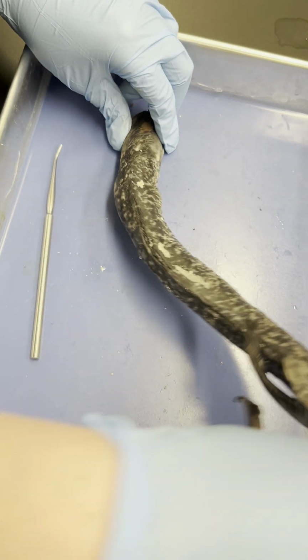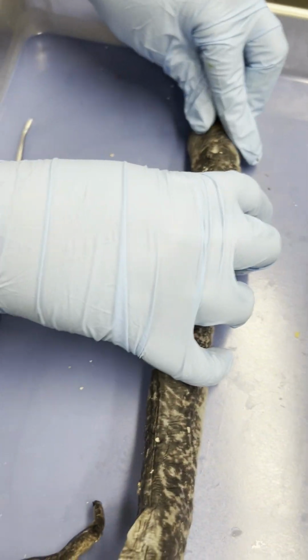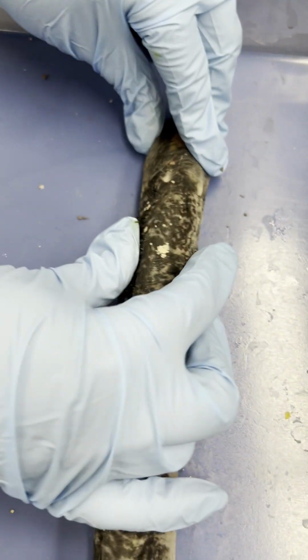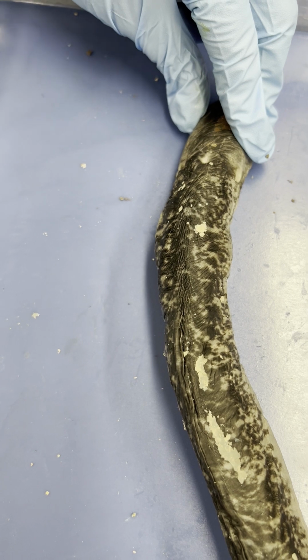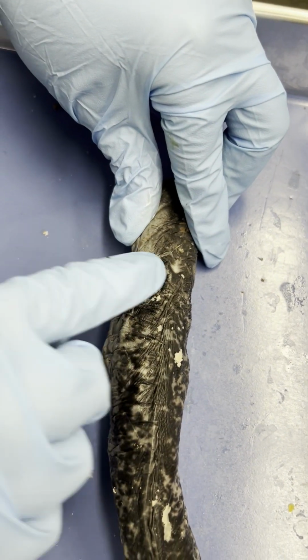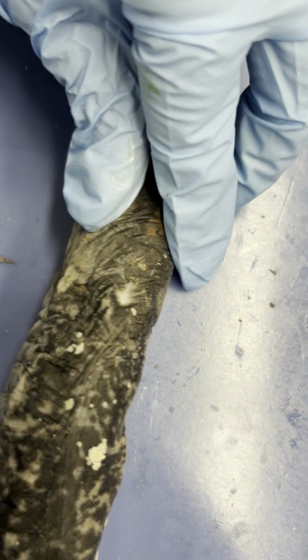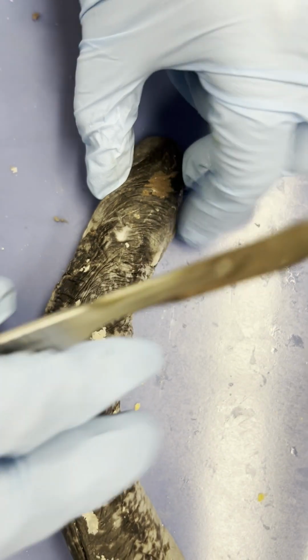So move these other guys out of the way. And our first one, as we can see on page 22 of our lab manual, our first cross section is through the pineal organ and eyes. So I want to line up, and I see we've got our pineal organ, we have our eye. So we're going to make a cross section cut right through there.